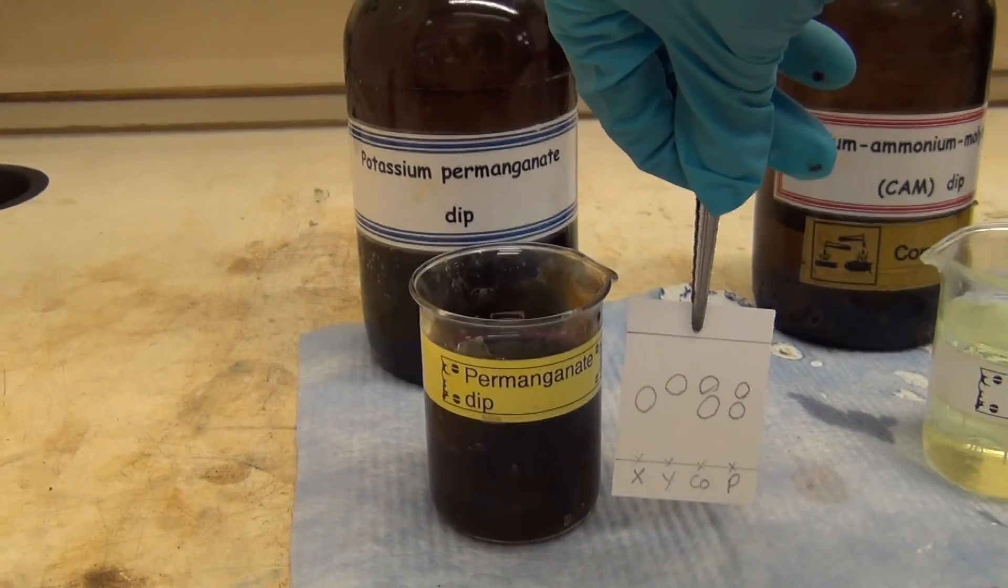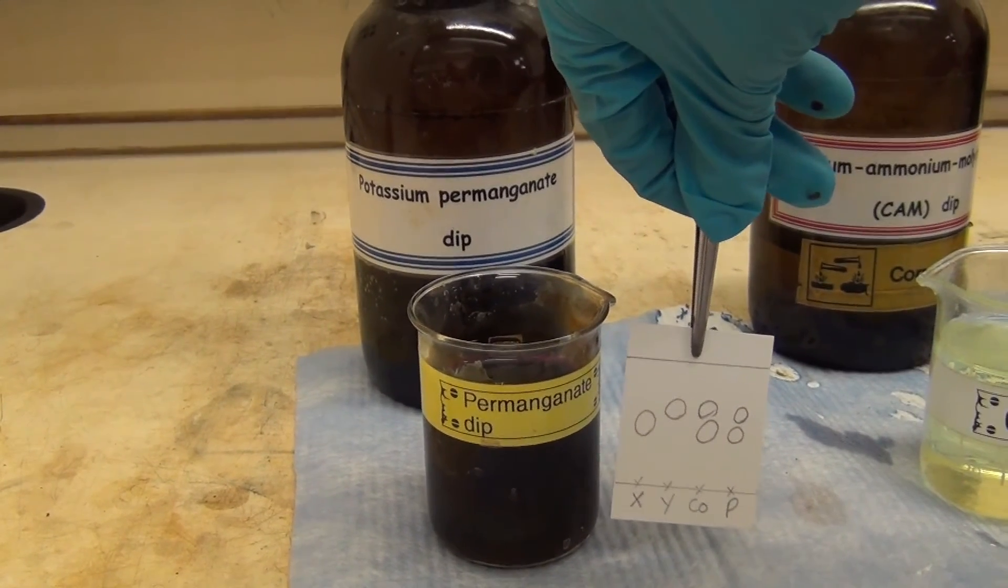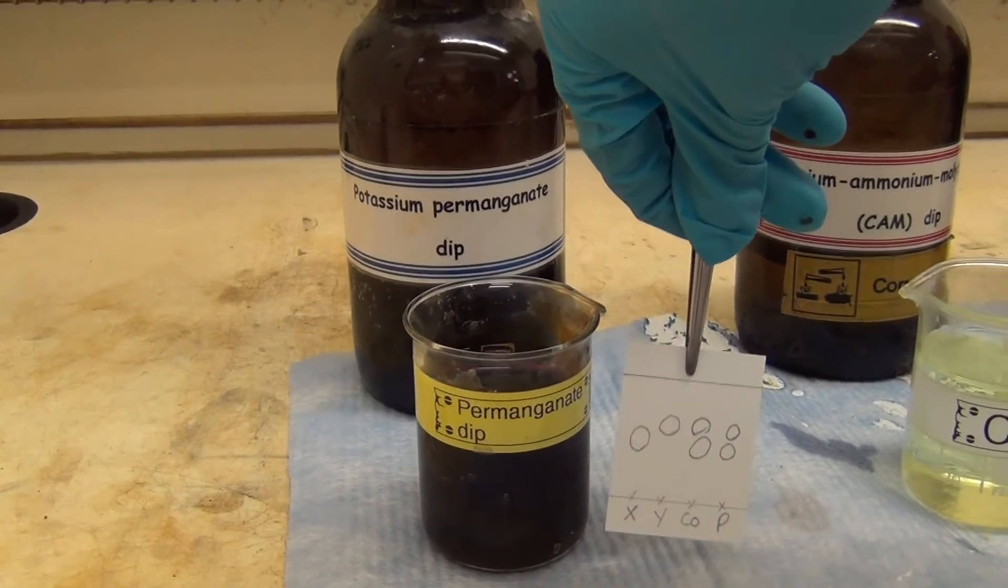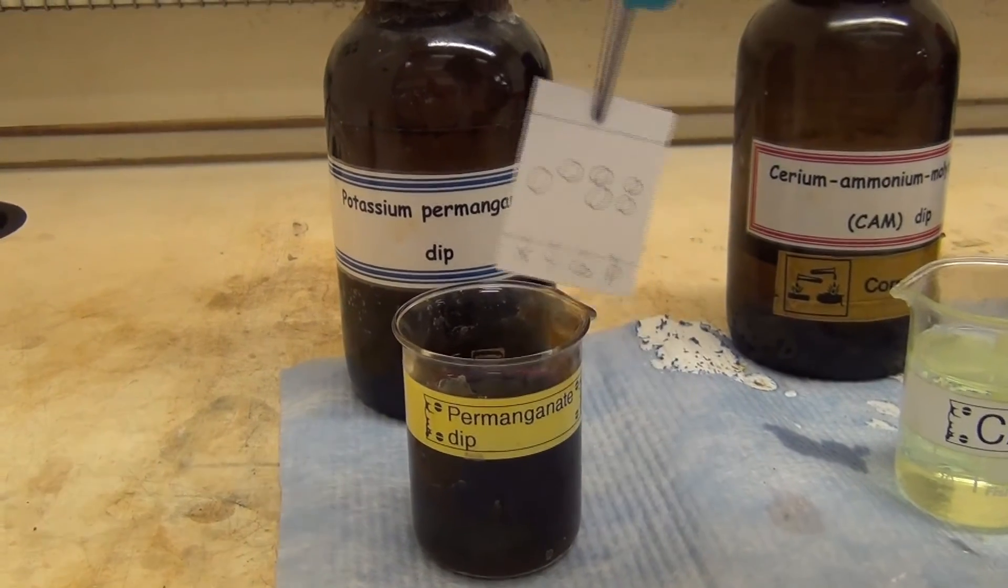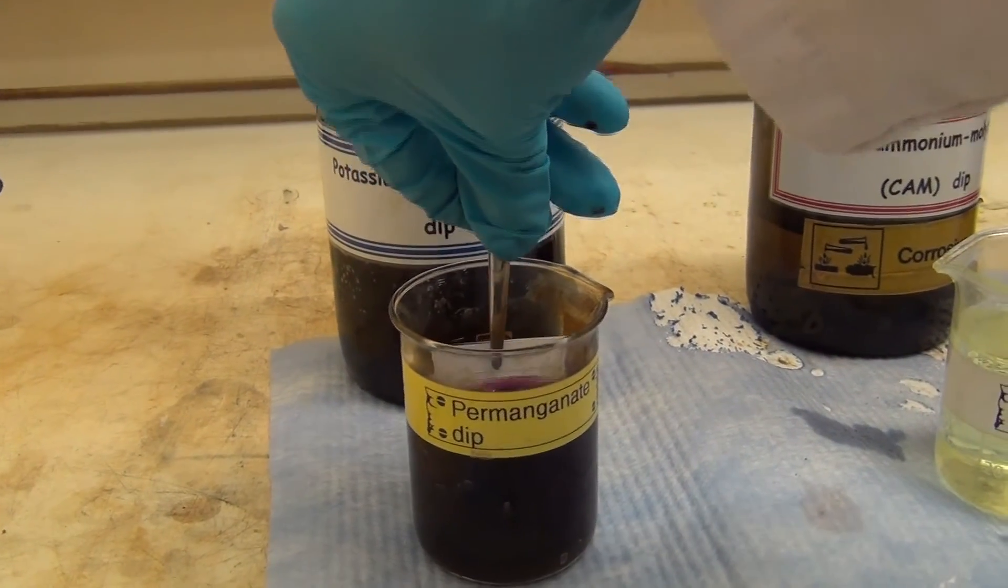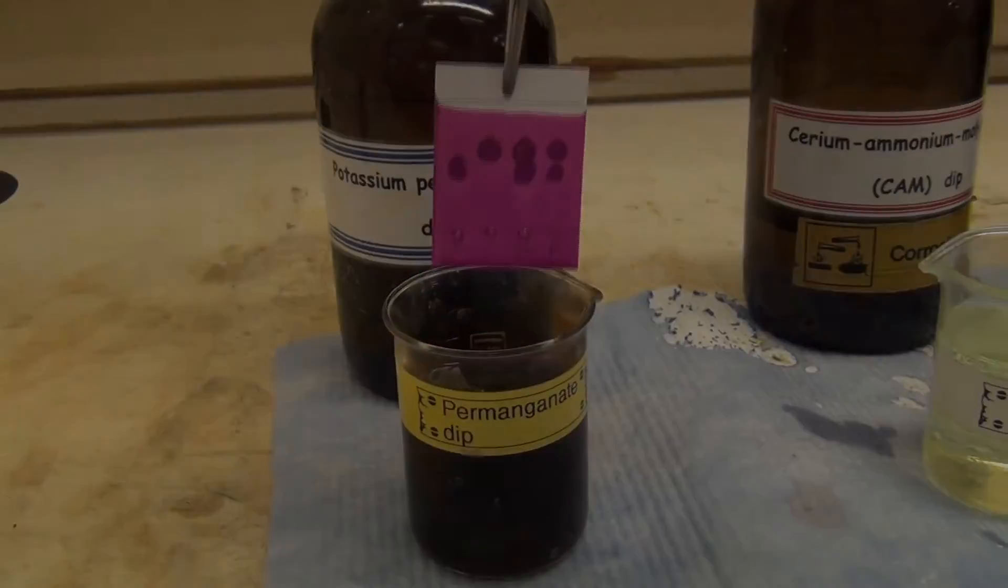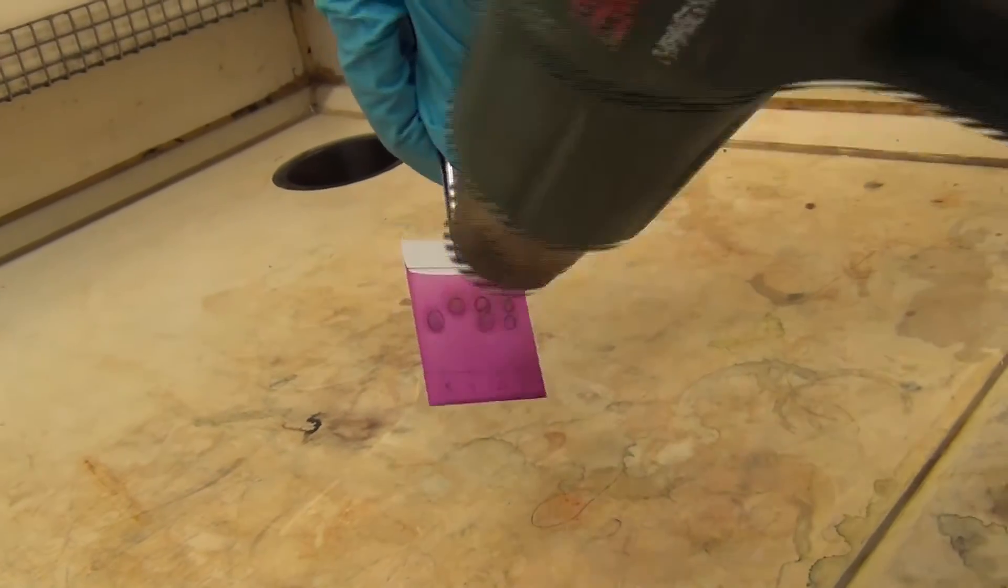However, UV does not always visualise all of the spots on our plate, and as it is a non-destructive technique, it is common to also check using a dip, such as permanganate. Dip the TLC plate into the dip, and then dry using a hairdryer to remove any excess dip.